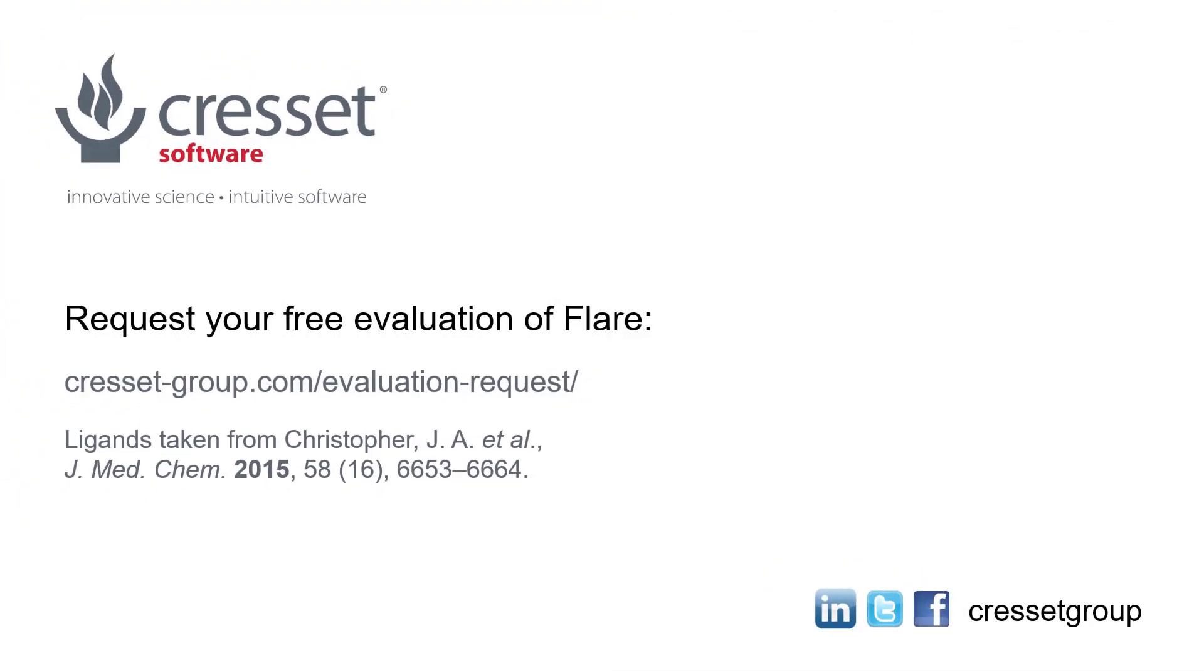Evaluate Flare to see for yourself how electrostatic complementarity surfaces and scores can help inform your research.